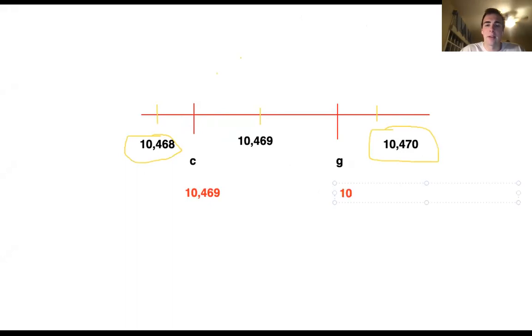And then we had 10, sorry, this one should be 10, 6, 4, 8. It will not allow me to edit it? That's annoying. Undo, undo. 6, 8.